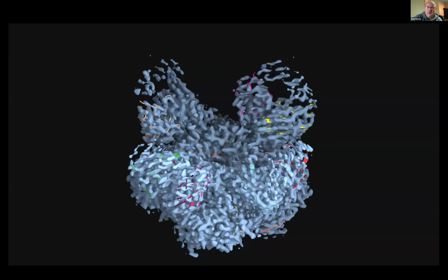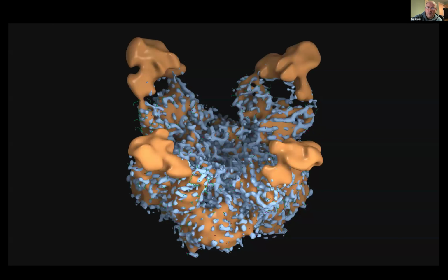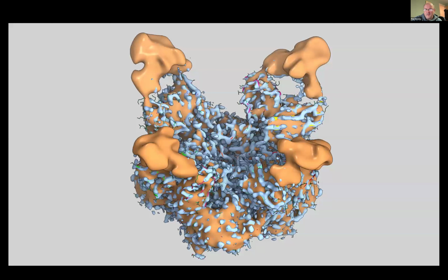They didn't put a model in the constant domain, but with the easy access to sharpening and blurring now, we could create a reconstruction or a variation of the reconstruction that allows us to see where the constant domain is, and you could have modeled that if you'd have wished. It looks okay in a white background, I would say. Of course, you decide.